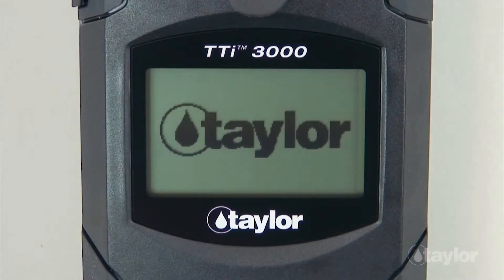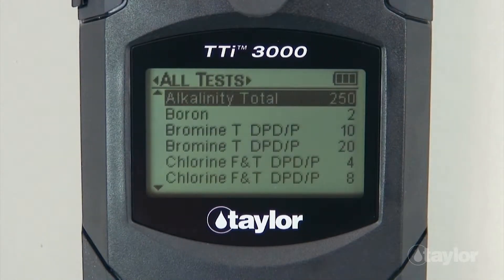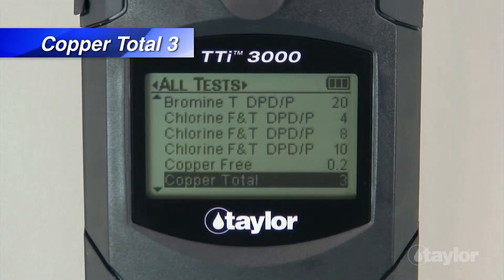Press the Power button to turn on the colorimeter. Press the Main Menu button and select a test menu: All Test, Recent Test, or Favorites. For this demonstration, we will select the All Test menu, which contains a list of pre-programmed Taylor tests. If you have added the Copper Total 3 test to your Favorites menu, it can be found there also, or in the Recent Test menu if it's a test you have performed within your last 10 procedures. Scroll down to locate the Copper Total 3 test, then press Enter.